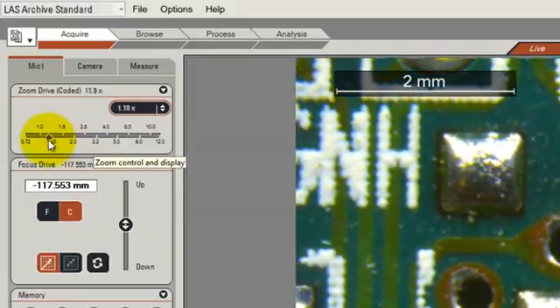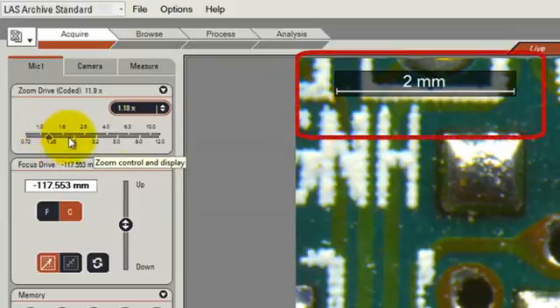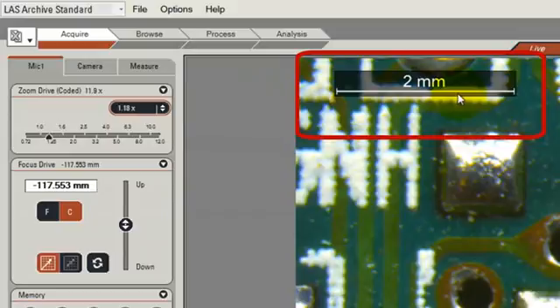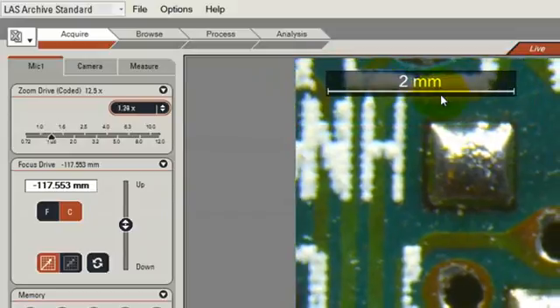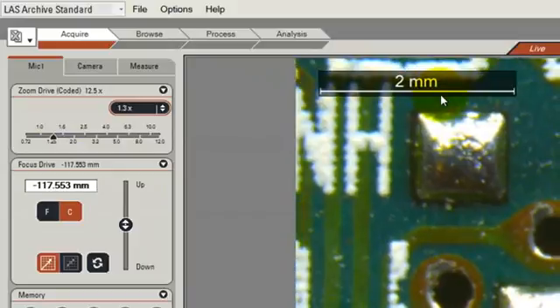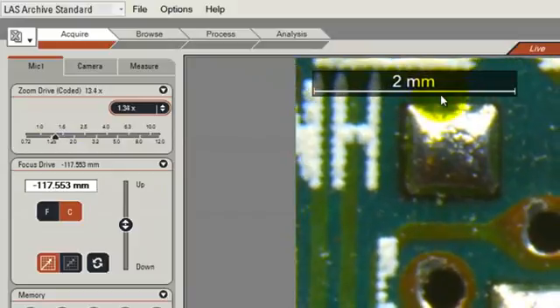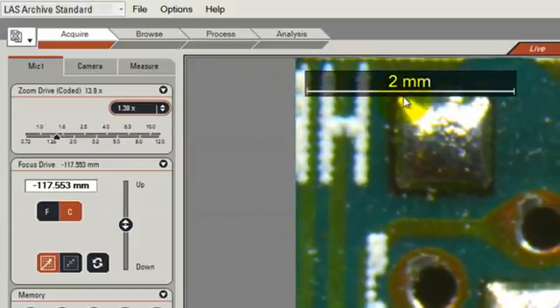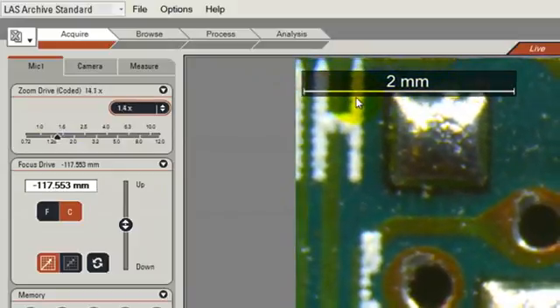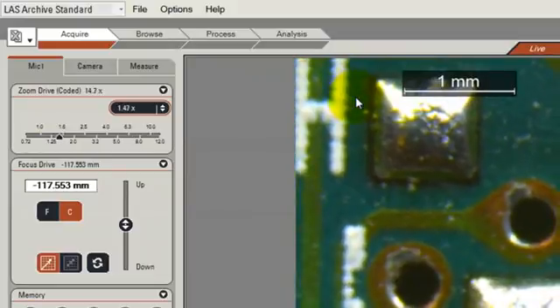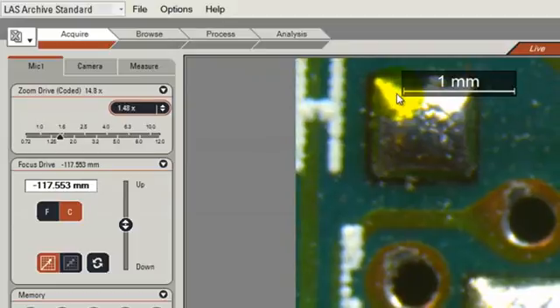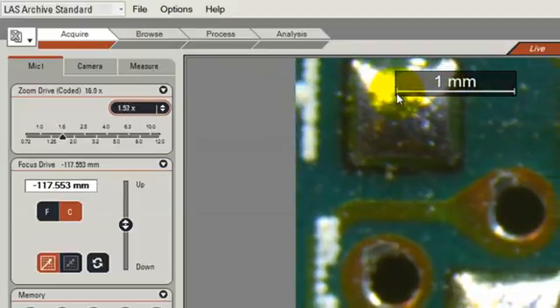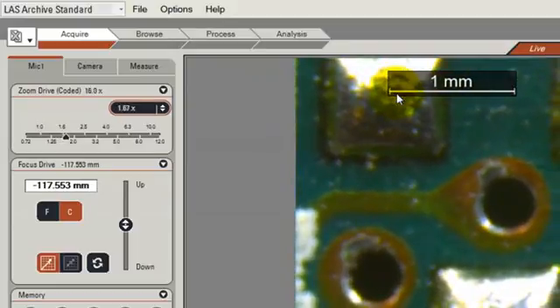At the same time as I adjust the zoom level, you can see that the scale bar shown on the image is also adjusting in size. So if I go for higher zoom, the scale bar gets larger until at a certain point it switches from 2mm to 1mm and then it continues to increase.